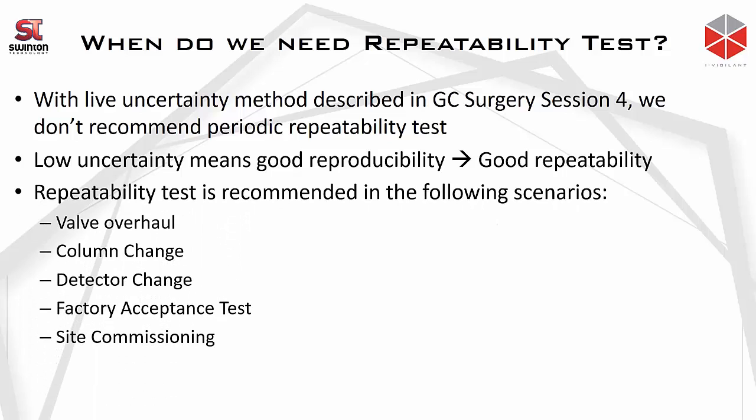But repeatability tests also have some place. They're still recommended in some scenarios. Some of the scenarios where we need to do repeatability tests are valve overhaul, column change, detector change, factory acceptance test, and site commissioning. Basically, every time you start up a GC, we need to make sure that the GC will work correctly throughout the time in the future.